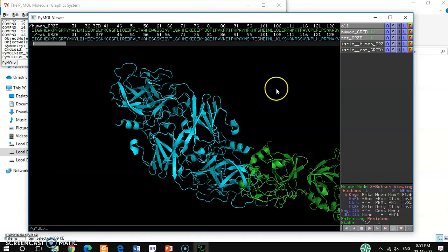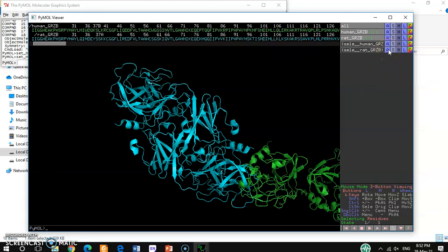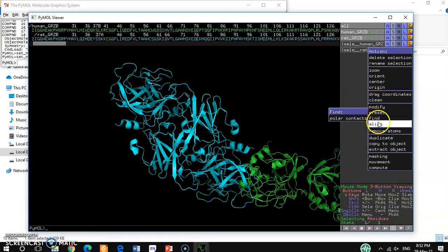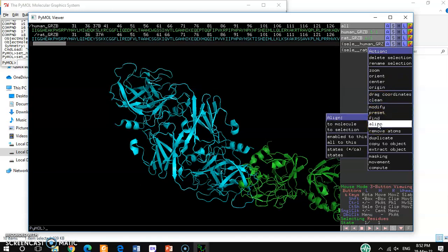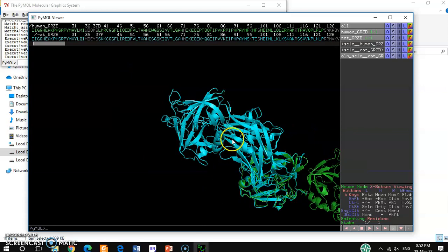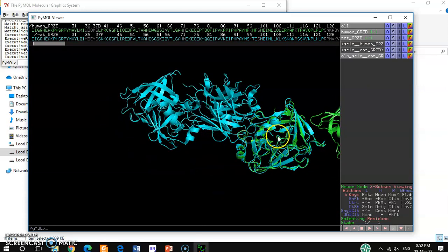These two parts of the two structures are already selected for alignment. Then you can hit the action button, and under the options you can find the 'align' tool. Select 'align to selections: human granzyme B', click it, and you can see the alignment very clearly.